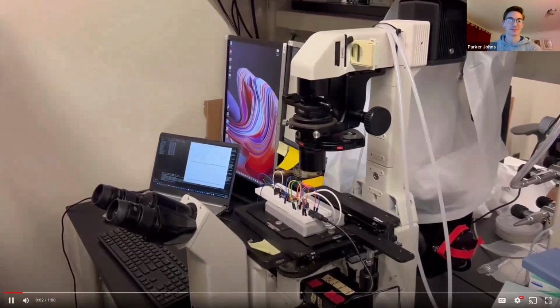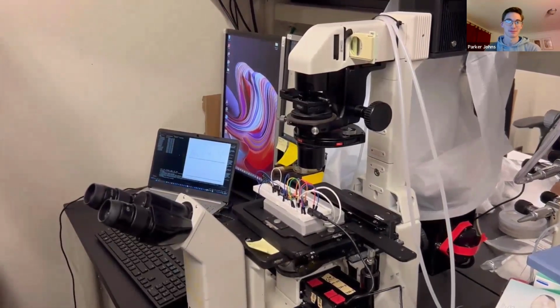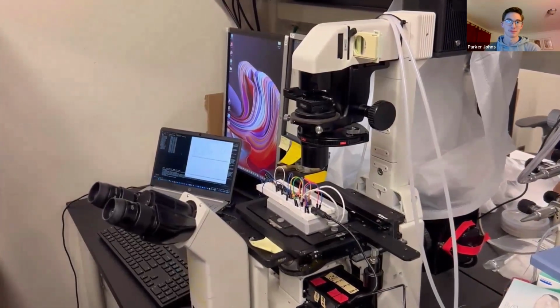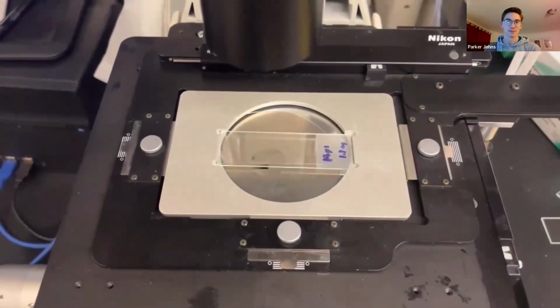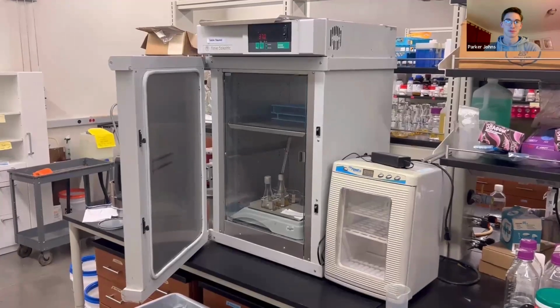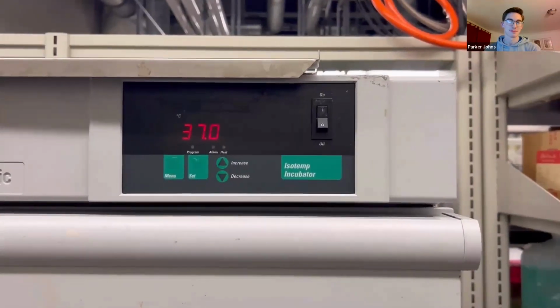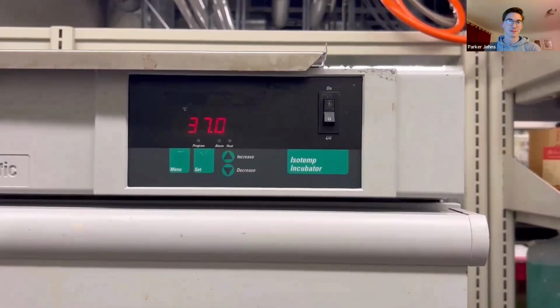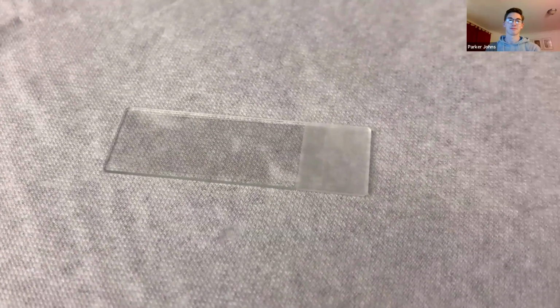For our project, we decided to solve a problem in Dr. Pitt's research lab involving this microscope. For one of the lab experiments, samples need to be examined periodically during an incubation period. For this to happen, microscope slides must be taken back and forth between an incubator that has a constant set point temperature of 37 degrees Celsius. However, taking the slides back and forth between the incubator can cause disruption in the sample placement and temperature.